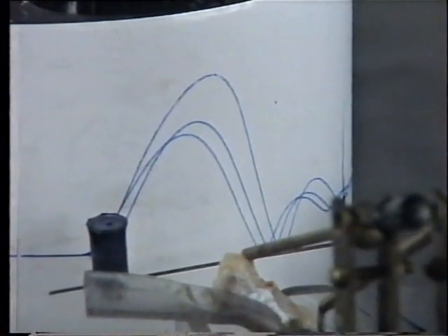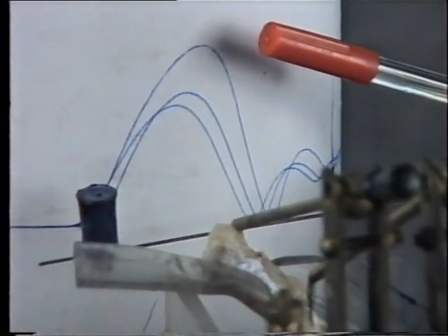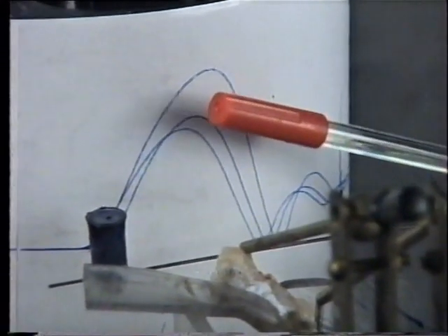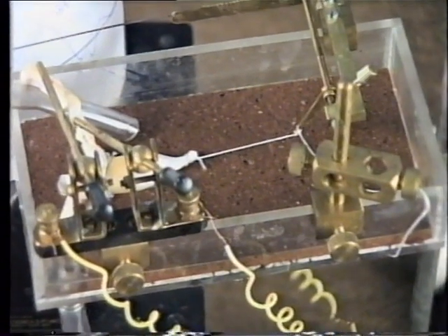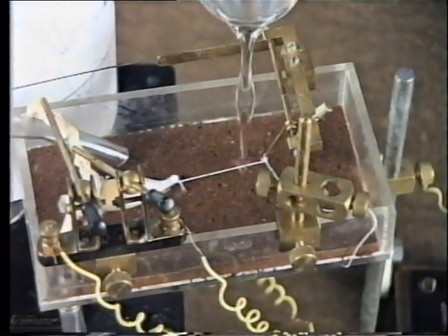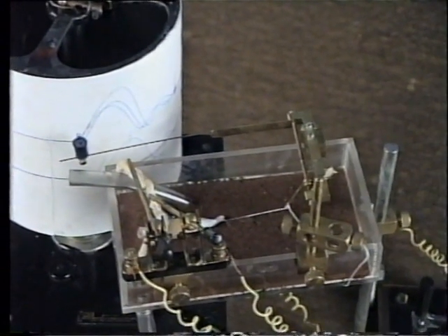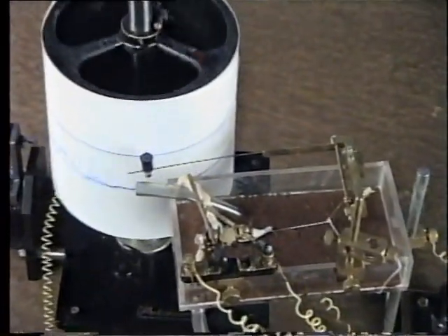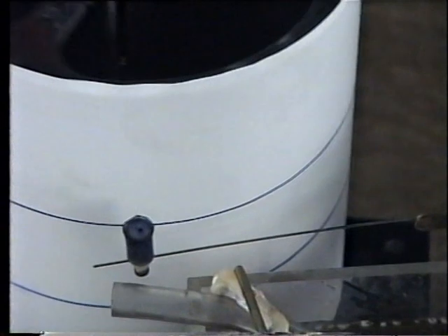This is the normal simple muscle curve; this is the simple curve with the effect of heat — you can see the increase in amplitude. To see the effect of cold, empty the tissue chamber and put cold water. Start the drum to record the graph. Now you can see the reduced amplitude.